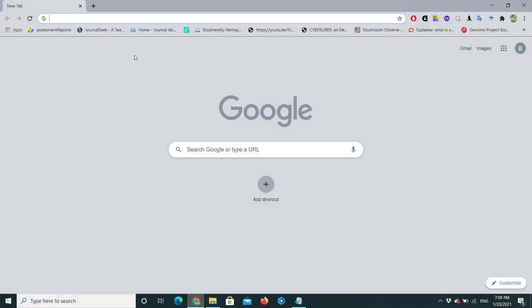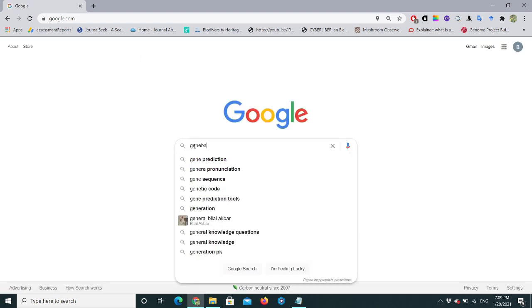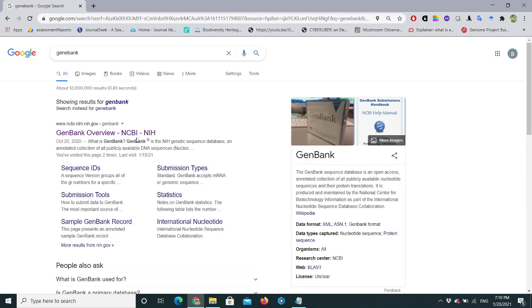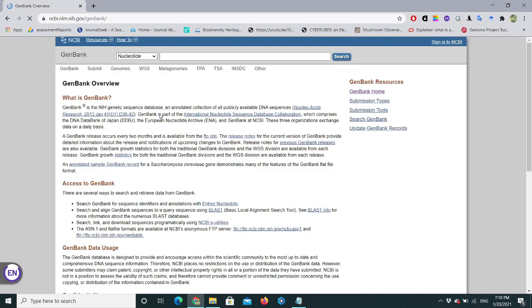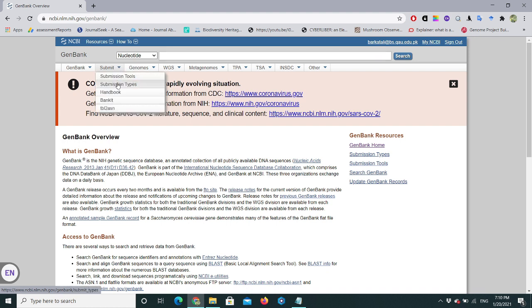Now let's visit NCBI. Just type 'GenBank' and you will see the NCBI website — click on it. On the top you will see the Submit option; open it and we will go directly to BankIt.